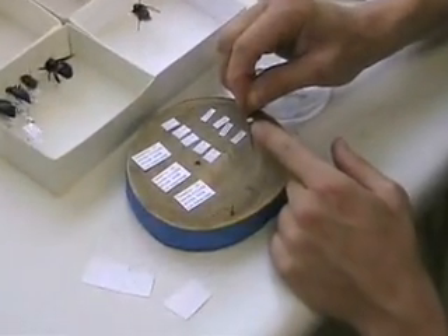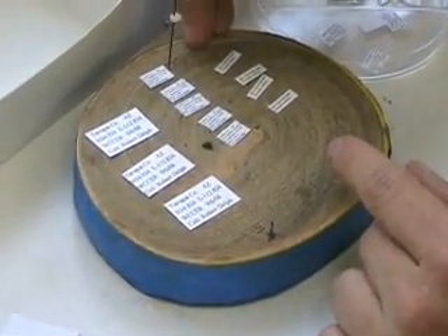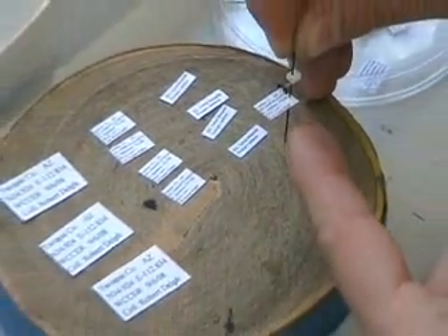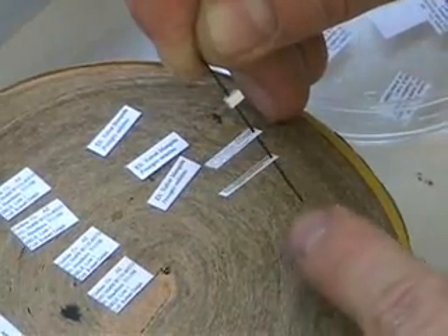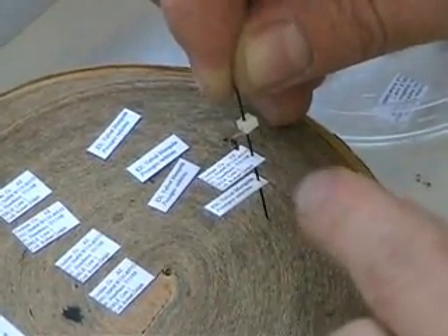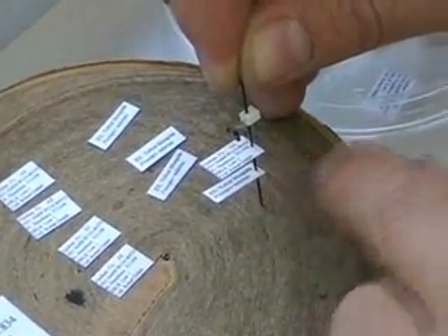This one's on a minuten pin and gets pinned the same way as a pointed specimen. I pin it through the label on the right side and leave about 10 millimeters distance from the specimen to the label. This is a bee collected off of velvet mesquite, Prosopis velutina, so I have a second label for the species of plant the bee was found on. When setting up a collection, it's also good to have host plant or host specimen information — for example, if you collected a flea off a cat, you'd note 'extracted from Felis domestica.'